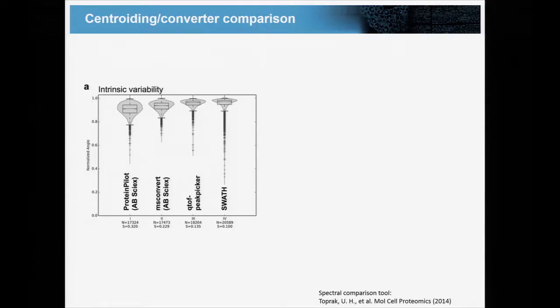And so something we looked at also is, there was a master's student in our group. We were interested in this question about comparing similarity of spectra. So if you take 2 spectra and you sort of overlay them, how similar are the relative intensities? And a master's student in our group wrote a tool basically that does these comparisons. And if you're interested in doing this kind of thing, it's a nice, user-friendly Python GUI tool. So you can take spectral libraries and take one, input the other, and do a comparison. And so we did some comparisons of these various peak picking algorithms, and also in swath.